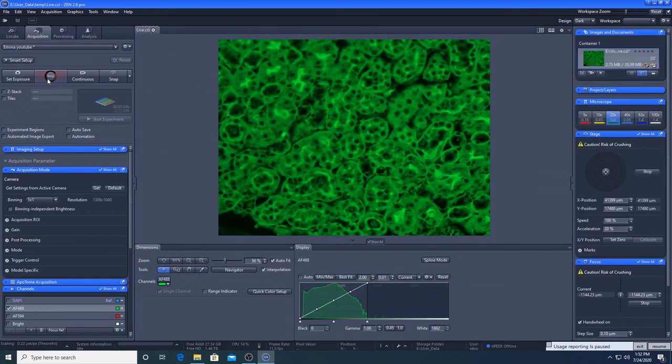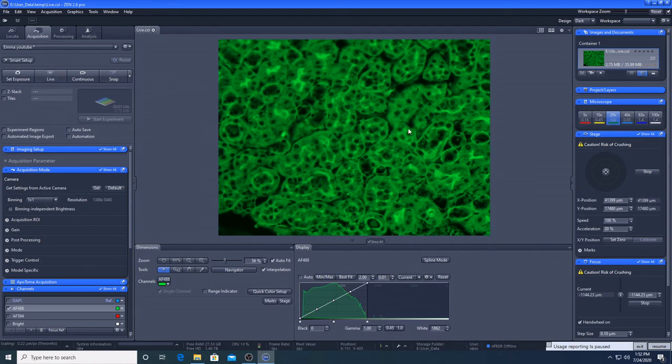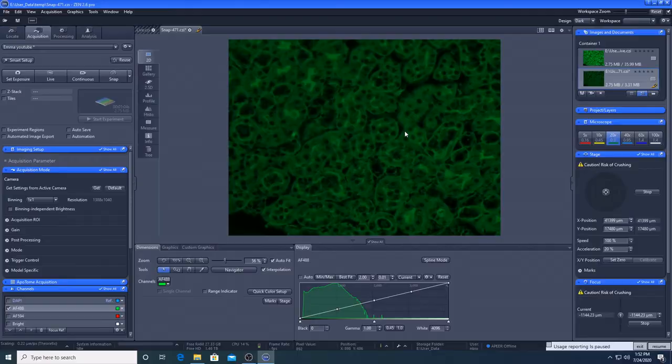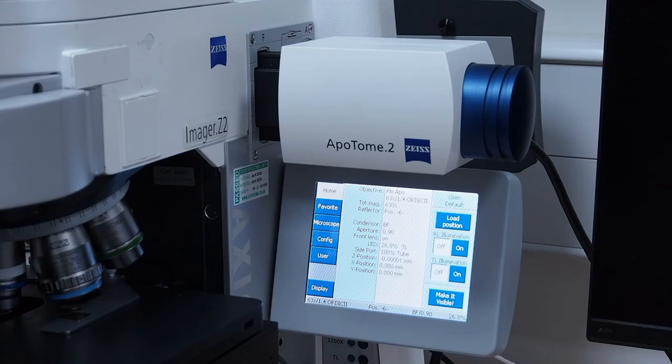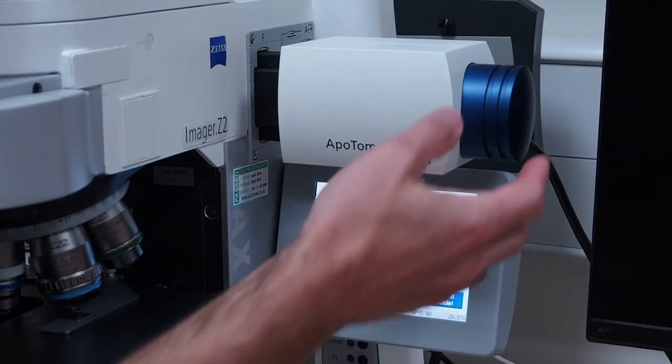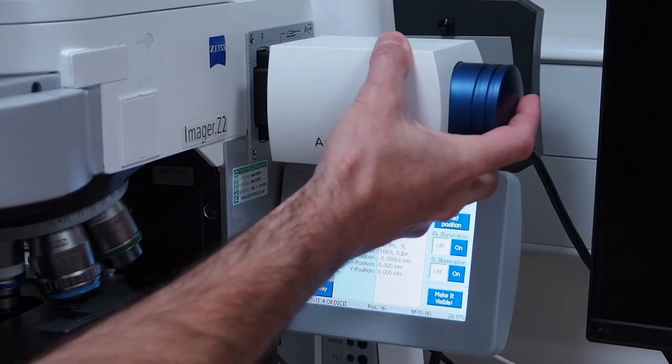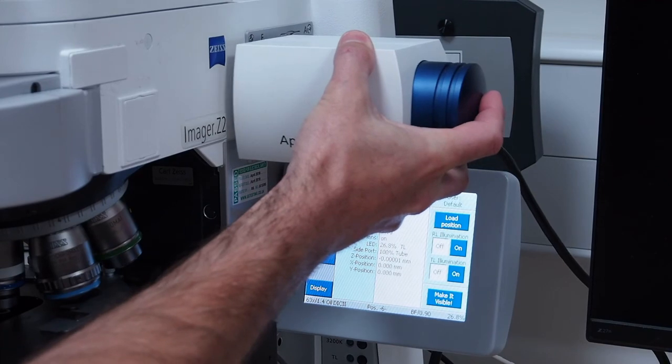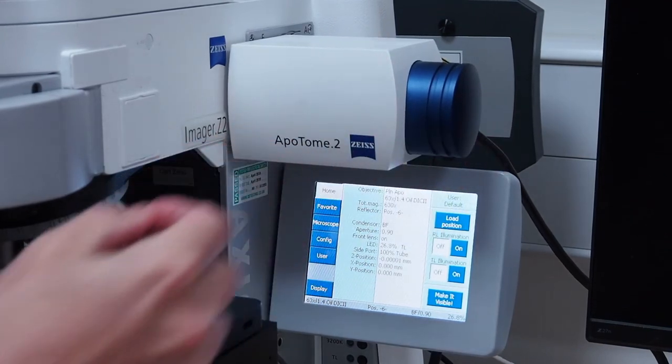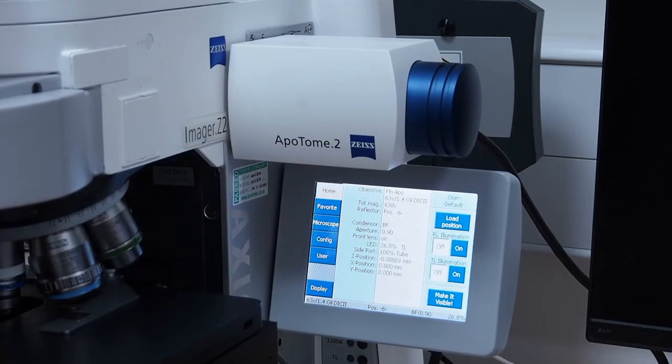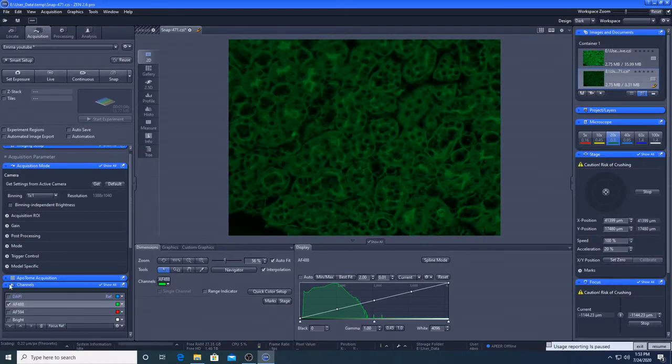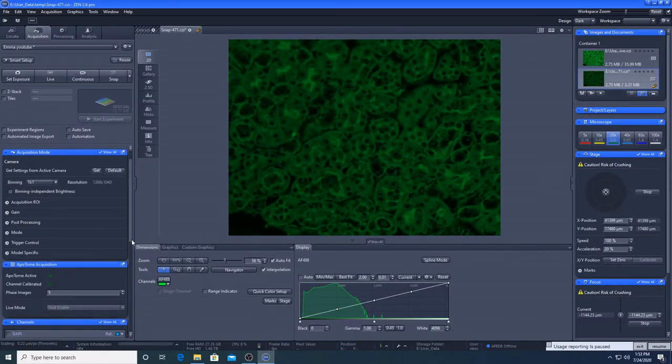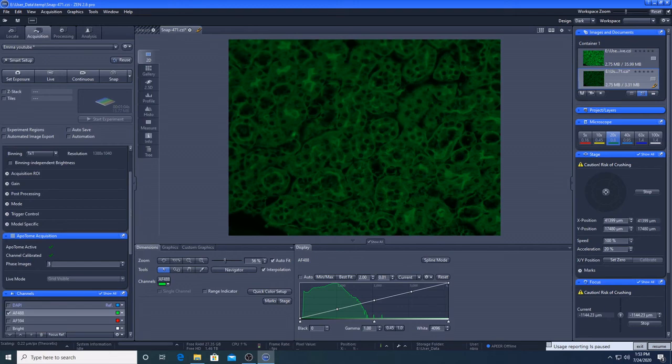So we're going to discuss the use of the Apotome. So we still have our mouse tissue here and we are going to take a quick snap. The Apotome is digitally encoded so the software knows whether it is in place or not. To use the Apotome module, manually push the Apotome slider into the microscope body. You should feel it click into place and it will audibly beep when correctly seated.